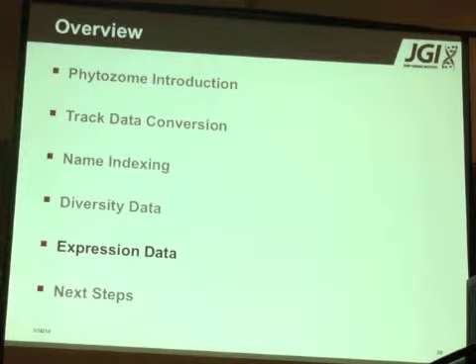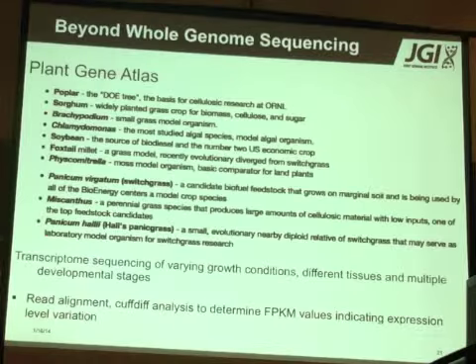And so not to spend too much time here, although it looks like I have a couple more minutes. One of the other, so this comes out of having way too much RNA-seq data to work with. So for the JGI, we have this initiative starting up called the Gene Atlas, which is basically, Jeremy Schmutz called it modENCODE for plants, which is probably pretty similar in intention.